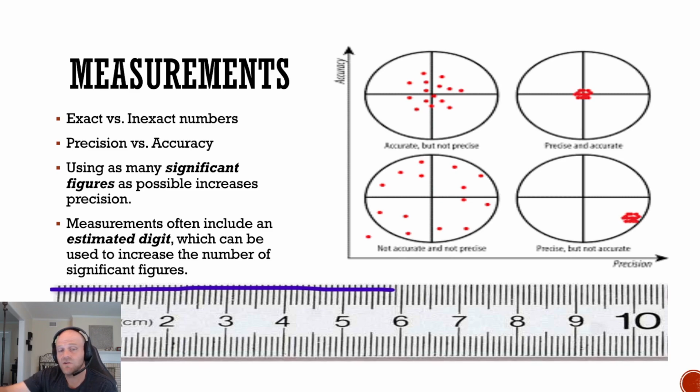It doesn't matter what the scale is, okay? If this scale is going by, I'll do another one with a graduated cylinder, but most of them will go by either ones or a tenth at a time. So you're going to add a 0 or 5 no matter what, okay? If it's, let's say it falls directly on the 6, okay? That would be 6.00.